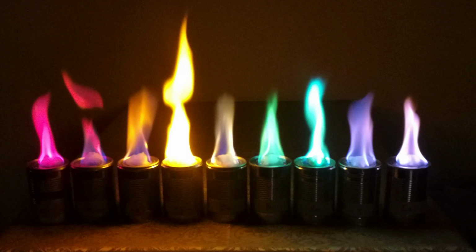magnesium turns bright white, molybdenum turns yellowish green, sodium turns intense yellow, phosphorus turns pale bluish green, lead turns blue or white, rubidium turns red-violet, antimony turns pale green, selenium turns azure blue, strontium turns red, tellurium turns pale green, thallium turns pure green, and zinc turns bluish green.